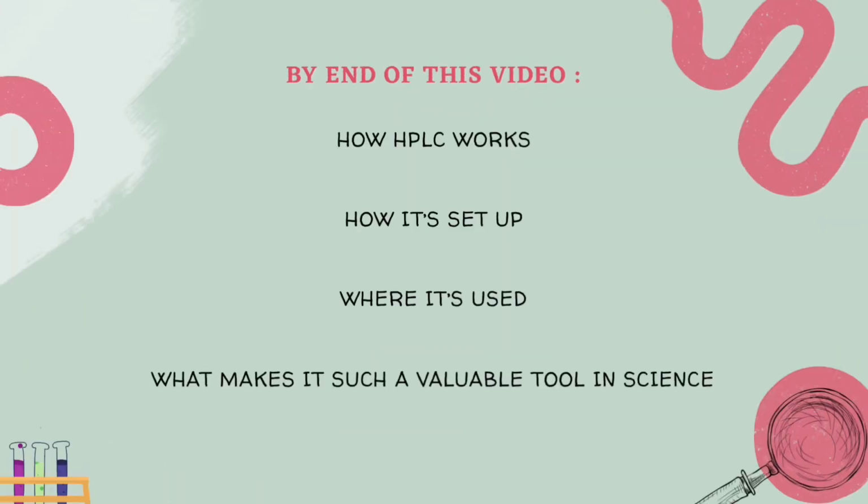So, by the end of this video, you will understand how HPLC works, how it is set up, where it is used, and what makes it such a valuable tool in science.